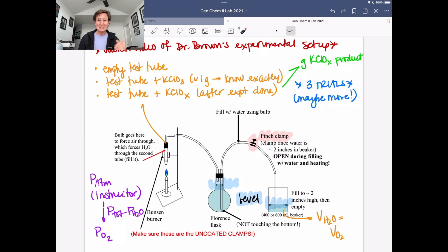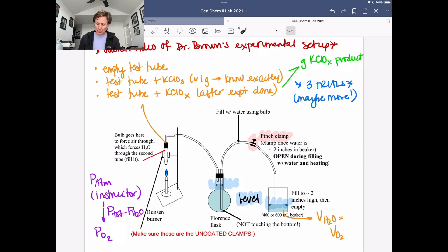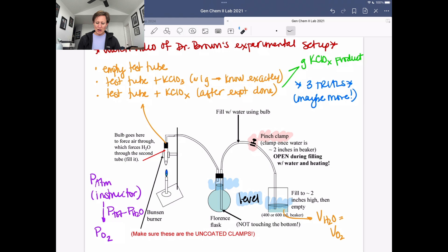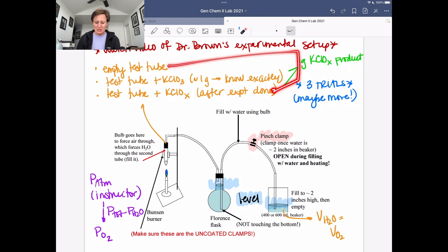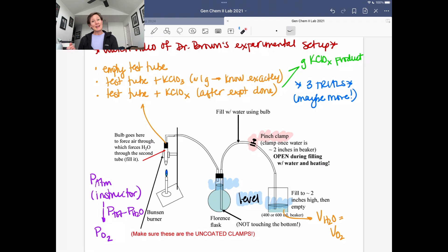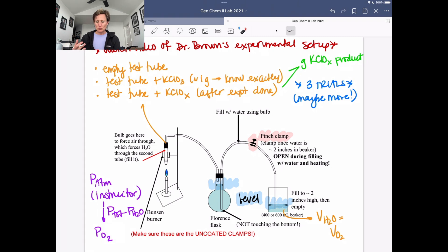The difference of those is going to tell us the mass of potassium chlorate we used. We do the experiment, liberate some gas, and we're going to use the pressure, volume, and temperature of the gas that's liberated. Then you mass the test tube at the end, and the difference between the empty test tube and the end result tells you the mass of the product that you made.